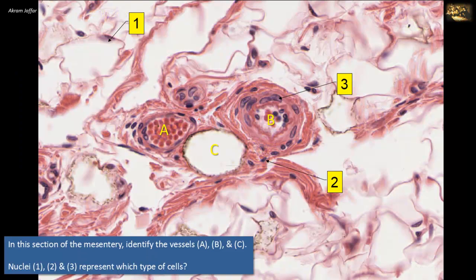In this section of the mesentery, identify vessels A, B, and C. Nuclei 1, 2, and 3 represent which type of cells?